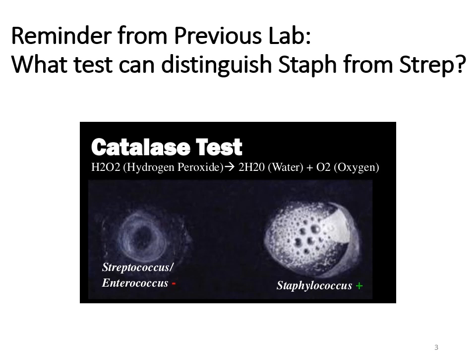So anytime that bacteria comes in contact with hydrogen peroxide, you see that bubbling effect. Again, the way you could remember this is when you have a cut. If anyone has ever put hydrogen peroxide on a cut, you see that bubbling because your skin is so chock full of Staphylococcus. Whereas Streptococcus, you notice in the slide, there is no bubbling because they do not produce the enzyme. Make sure you're very comfortable explaining that.